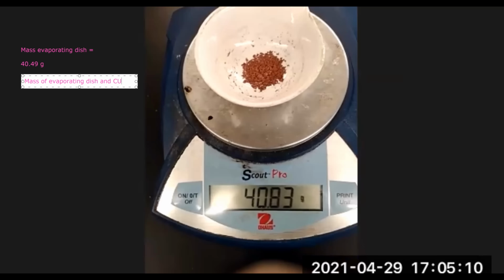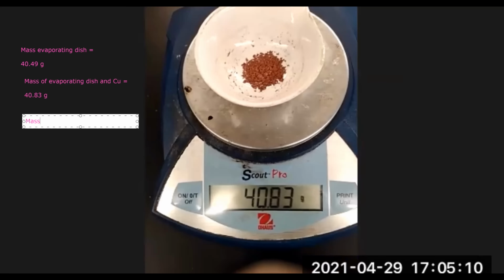So again, we put it in the oven, we dried the copper. We got a mass of 40.83 grams. Again, make sure the evaporating dish is at room temperature before you place it on the balance or mass of recovered copper.